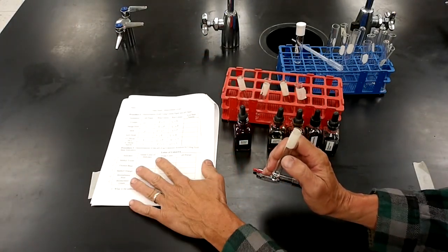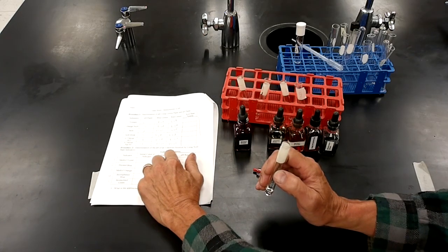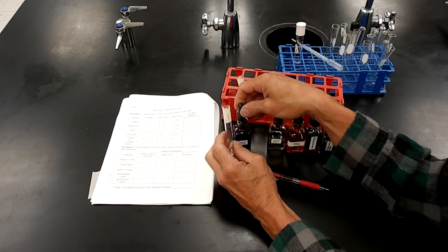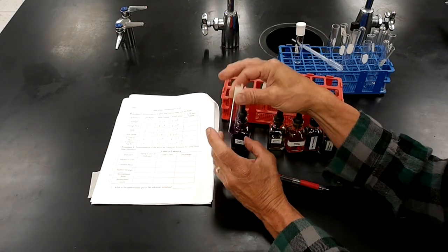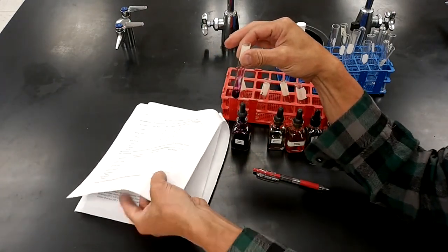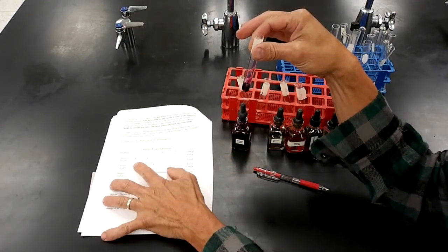so I'm working down here on the data sheet. This is procedure 2, determining pH of an unknown solution by using acid-base indicators. My tube 1 is methyl violet, so I will take a couple drops of methyl violet, 1, 2, add it to my solution. Mix it up a little bit. Now let's look back at that color chart. Here it is. Methyl violet.